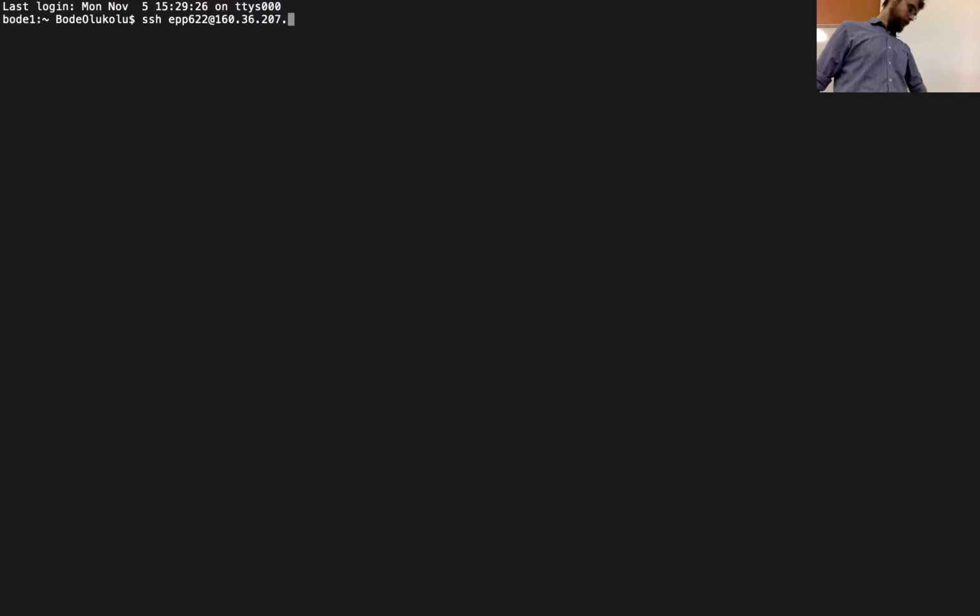So you could think of it as subsampling just 1 million, which means you'll be reducing your read depth because you're just sampling randomly, right? And we're only doing that because we want you to do this in under 30 or 45 minutes. It should still produce results though.